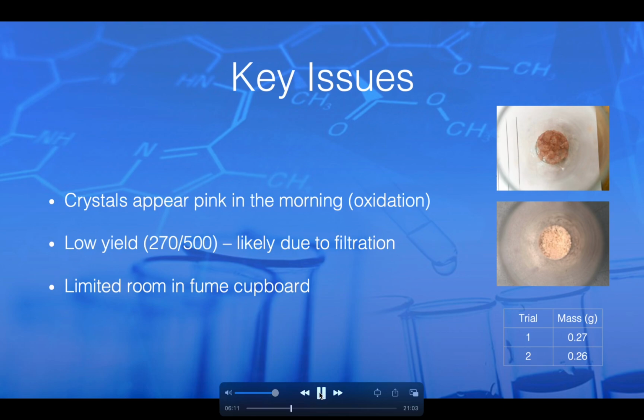Through observation, I noticed that acetone evaporated quite rapidly when I spilled some on the desk. It was gone in seconds. And the drips from the filter paper started steady and then slowed down. This is the filtrate coming through. This could mean that the acetone in the acetone paracetamol solution was evaporating while trying to get through the filter cake in the filter paper, leaving behind paracetamol in the filter cake.